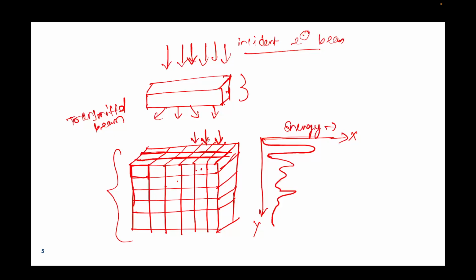Similarly, now I have taken all perfect atoms, but let's say there are dislocations somewhere. According to the dislocation, the defect, the extra material present somewhere inside this atomic column or atomic row of my material, the electron beam will also get diffracted, transmitted, elastically scattered and inelastically scattered.